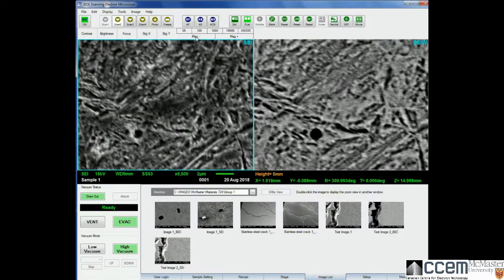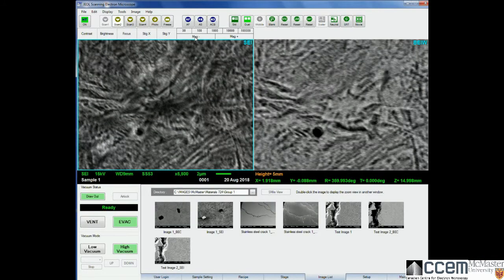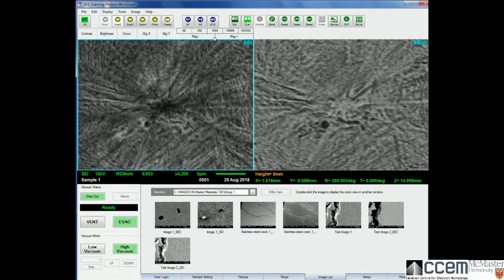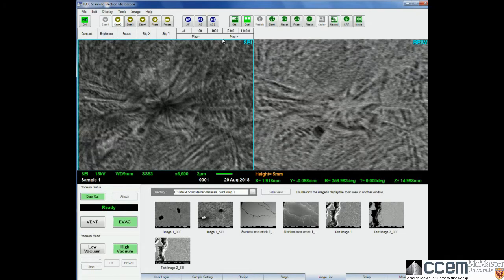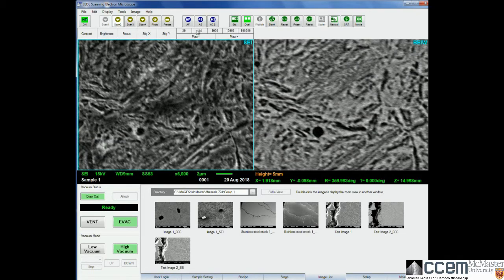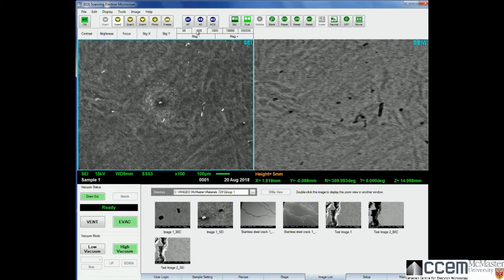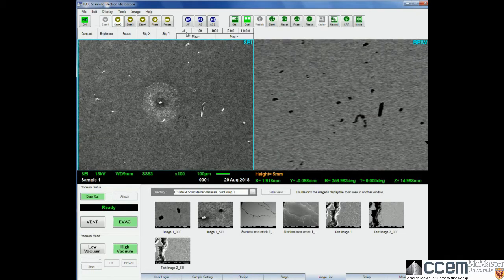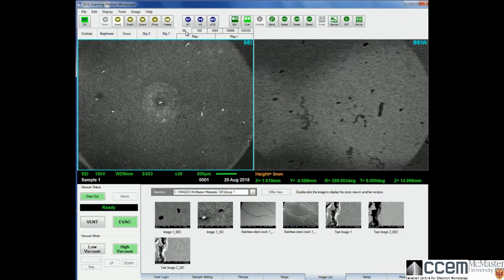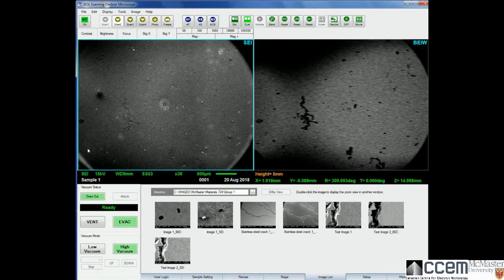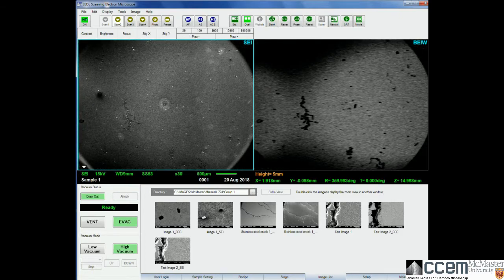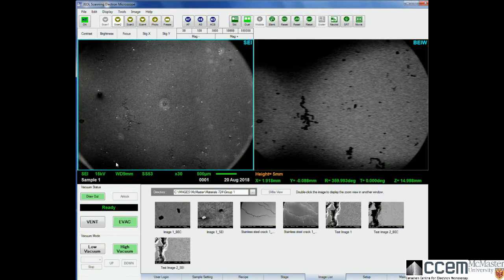You can go up and down in magnification by just clicking here, or you can go to set magnifications, which can be useful. 30 times magnification is actually the lowest you can go at a working distance of 10.